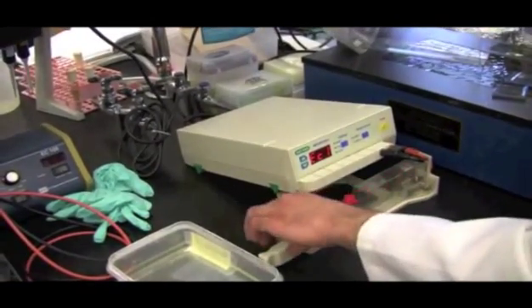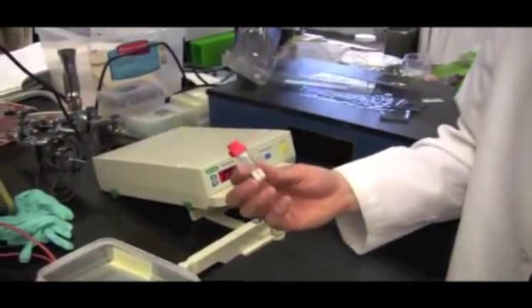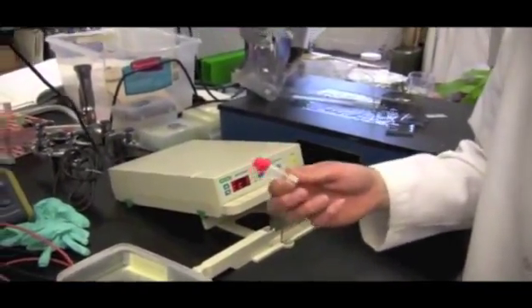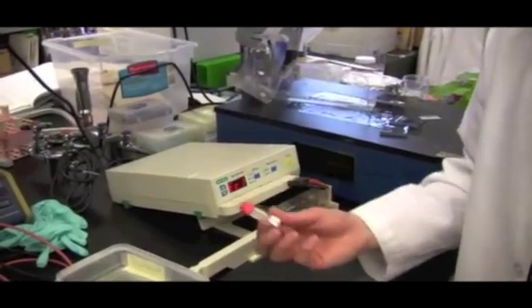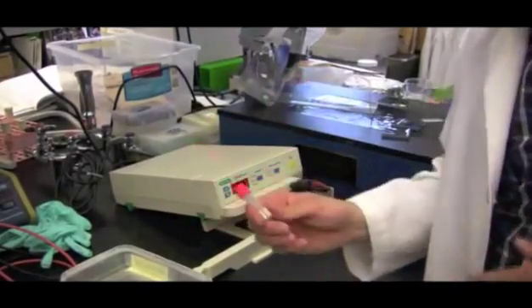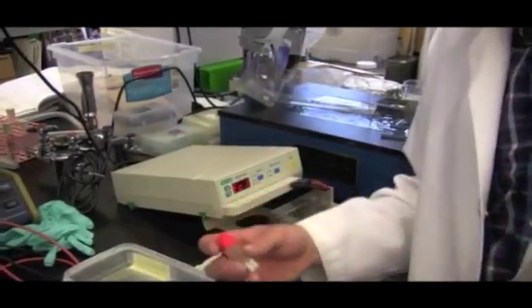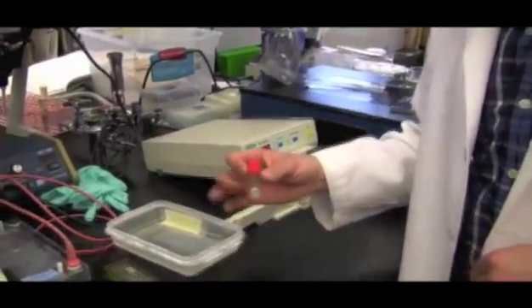Cool. Alright, so from here, all we have to do is grow the bacteria up, make sure that it has the DNA that we want inside, and then from there, like I said before, we can infect the plant, and hopefully it'll inject some of the DNA that we're interested in into our plant, and that'll tell the plant to make our protein with that special molecule attached. So let's infect some plants. I'm going to grab a syringe real quick.